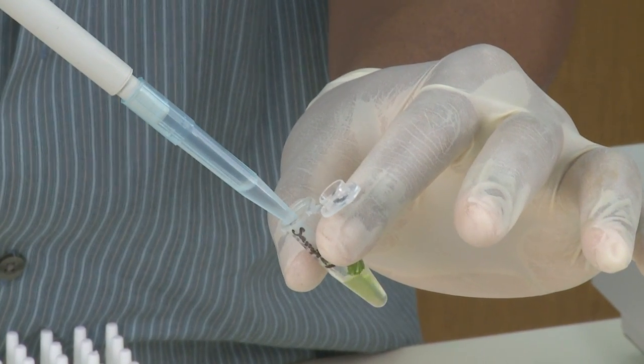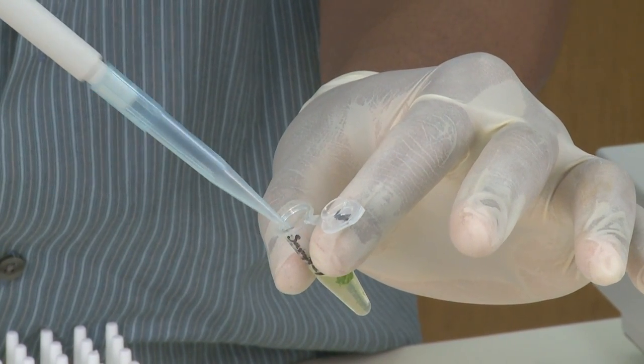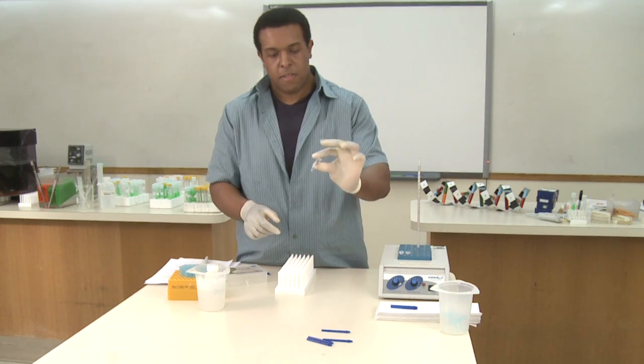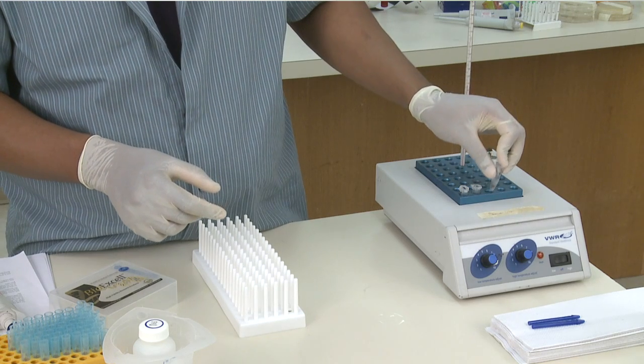Then add the remaining 500 microliters of the nucleolysis solution. Make sure to mix after you've added that last 500 microliters of the nucleolysis solution, and add this to the heat block.